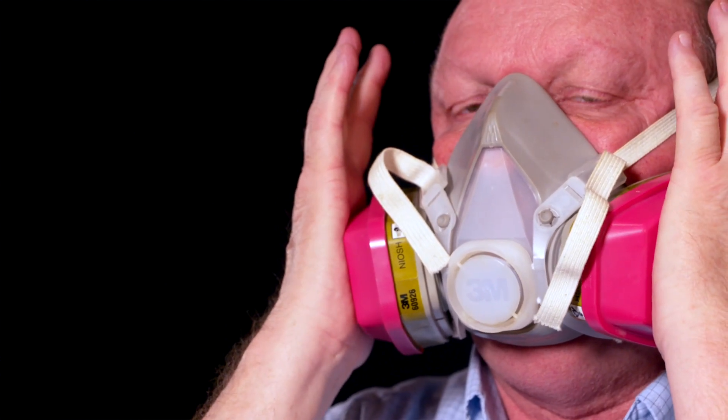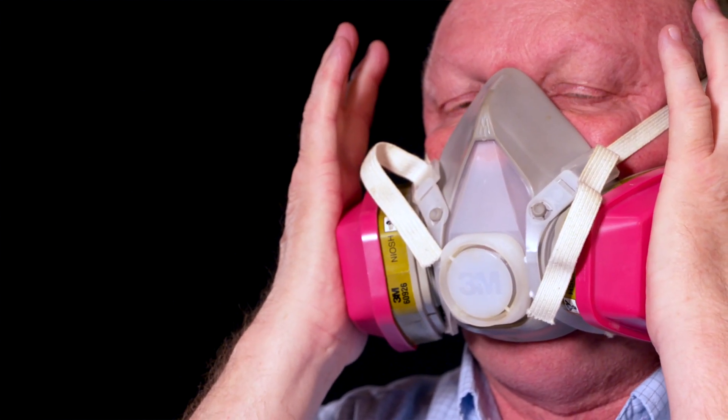Remember, on the input or the intake side of the respirator, you're actually going to be breathing in. On the exhalation valve, you're going to be breathing out.